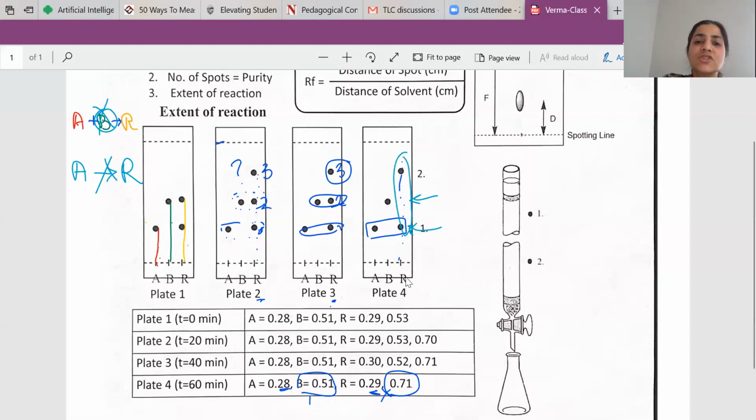When you have this mixture, and this is an impure mixture, why? Because you have more than 1 spot on your TLC plate in this sample. Let's say that you put the reaction mixture sample on your column chromatography column.